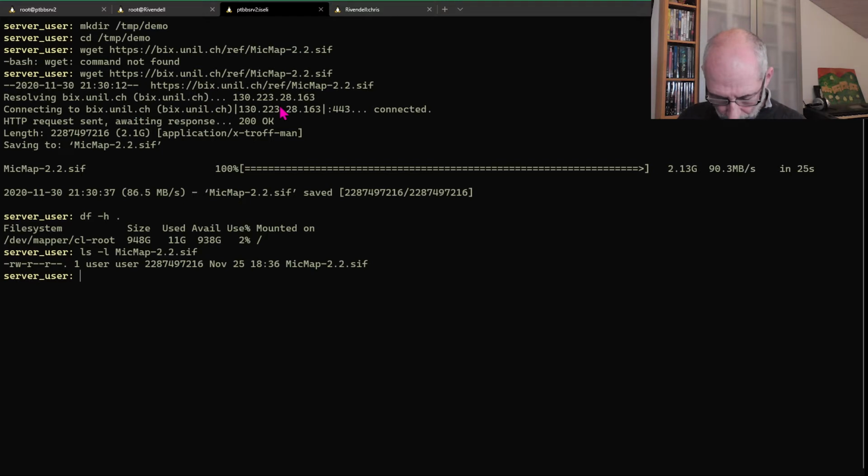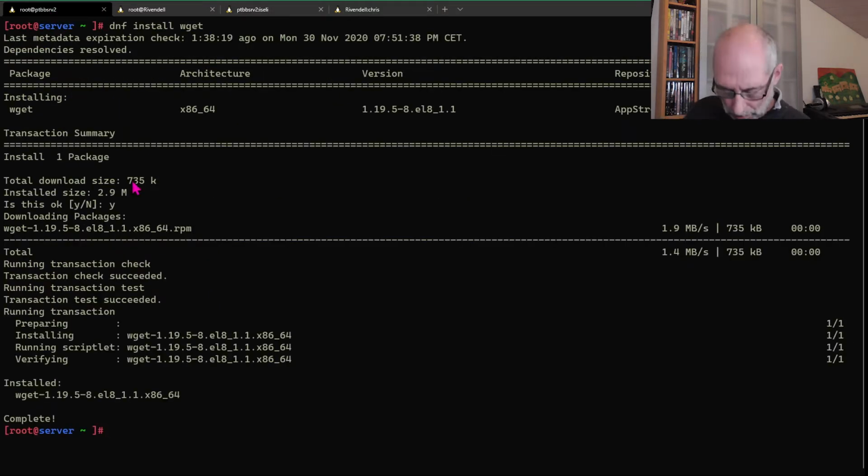Here, so now we need singularity to run it, which is probably not here, so that is another thing we need to get.